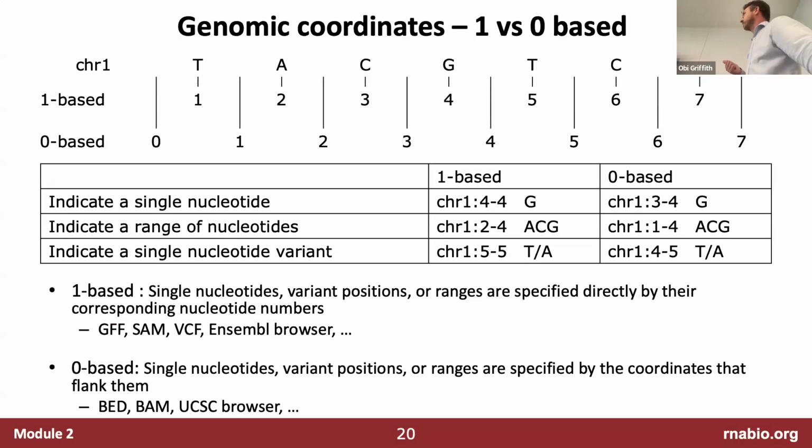We actually talked through this and I said there was a slide coming. So this is the slide, which graphically depicts what we talked about yesterday, that you have these 2 competing ways of thinking about the genome coordinates. One, where you're numbering the bases directly, right? So imagine you're at the very beginning of chromosome 1 and pretend that it doesn't have an unsequenced telomere at this moment, but you actually know what the bases are from the first base. There's a T, A, C, G, T, C, A. We would just call that first base number 1 and so on.